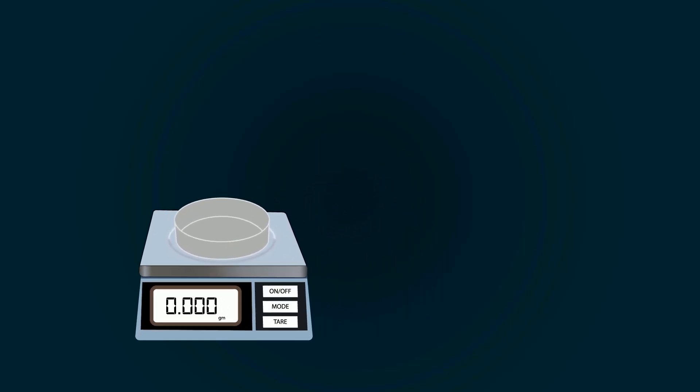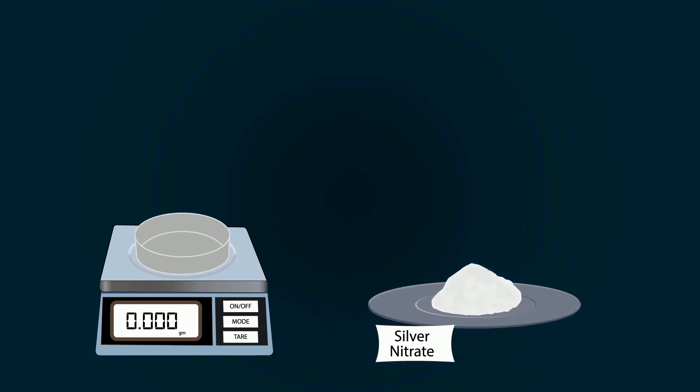Now start adding silver nitrate into the petri dish with the help of a spatula. Measure the weight precisely up to 16.987 grams.